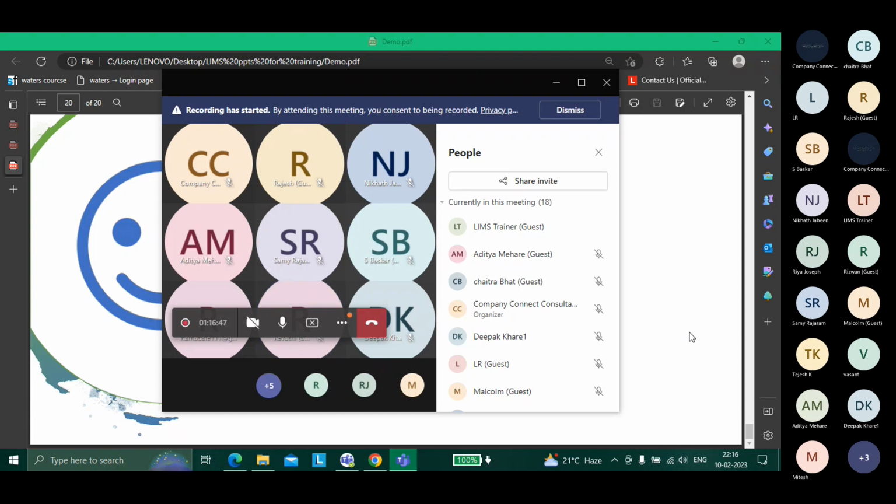Sir, can you just tell what IT companies are using this, like making this software, like Accenture, as I know. They are not making, Accenture, Infosys, they are providing service, right? No one is making. LabWare is creating its own LIMS software, which is known as LabWare LIMS, right? LabVantage is creating its own LIMS software, which is LabVantage LIMS. Thermo Fisher, I think, is creating its own LIMS software, which is Sample Manager. If I'm not wrong, rectify me.